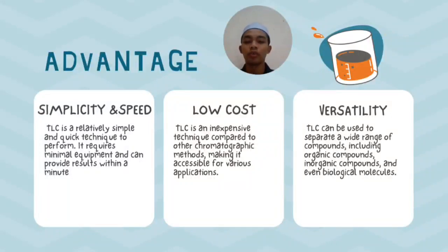Second one is low cost. Compared to other chromatographic techniques like HPLC or GC, TLC is generally inexpensive. The materials required are readily available and affordable, making it an accessible technique for various laboratories and educational settings.